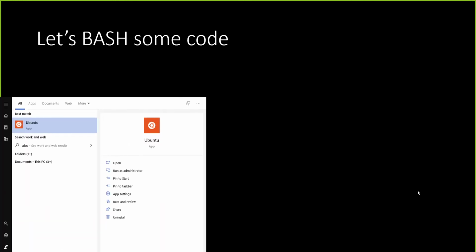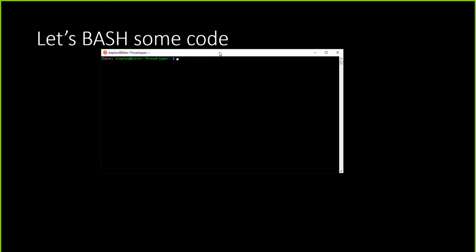Okay, well, so if you guys were able to install Ubuntu, like I'm pulling up right now, then you already have it installed. Most Macs have it. I think it's just the normal terminal. We might run into some issues, and if that is the case, then we'll just skip this section and make sure that you guys have the right packages installed and whatnot and go from there.